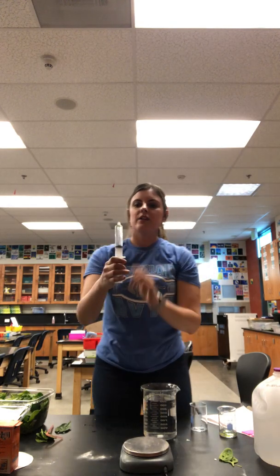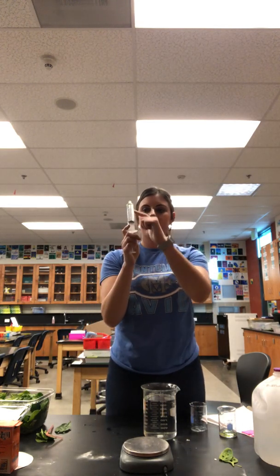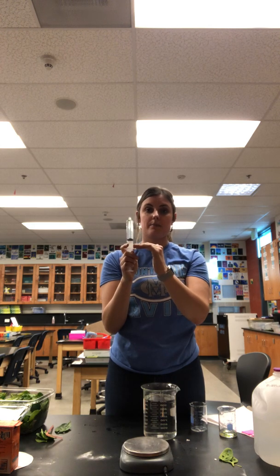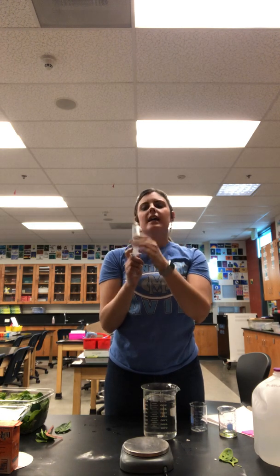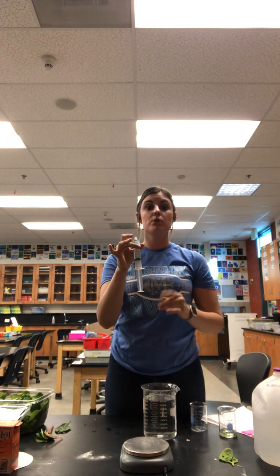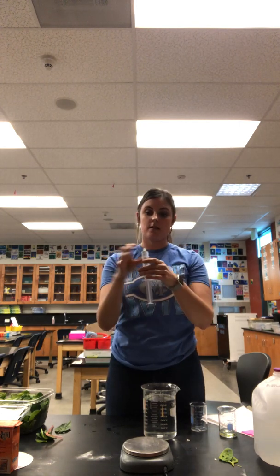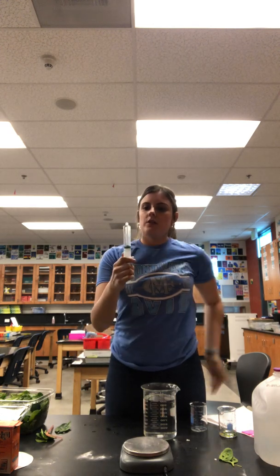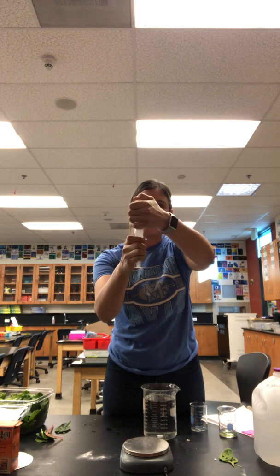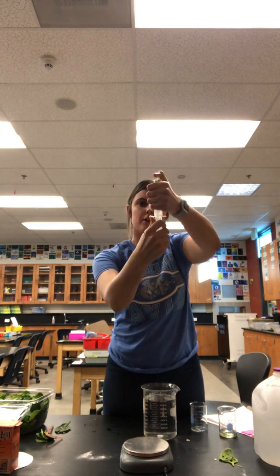Now we have the leaf chads at the top, but like I said, we want them to be on the bottom so that we can measure the rate of photosynthesis by how quickly they rise. To get them to the bottom, we're going to create a vacuum inside of our syringe to remove the oxygen from those leaf chads. To do so, we're going to place our thumb on top of our syringe and pull down on the plastic stopper. It's a little tough.